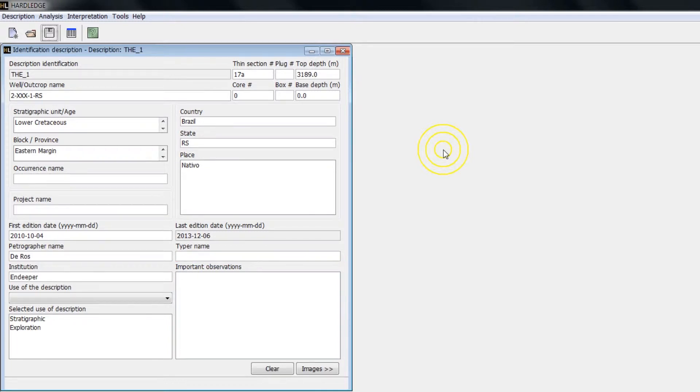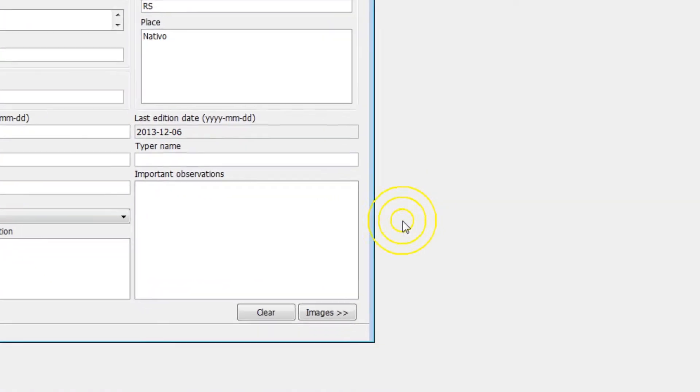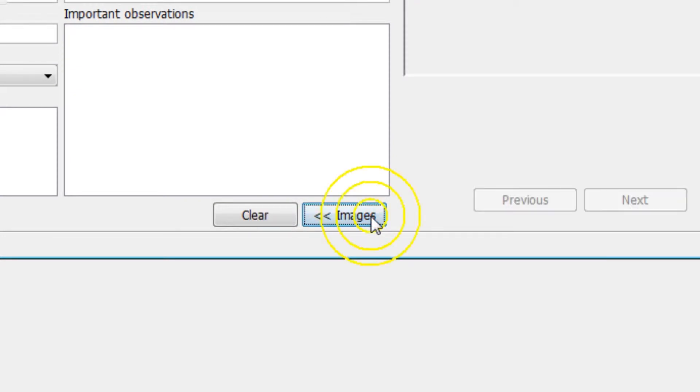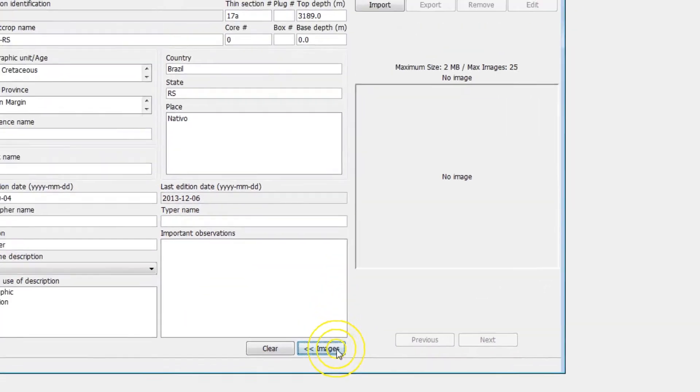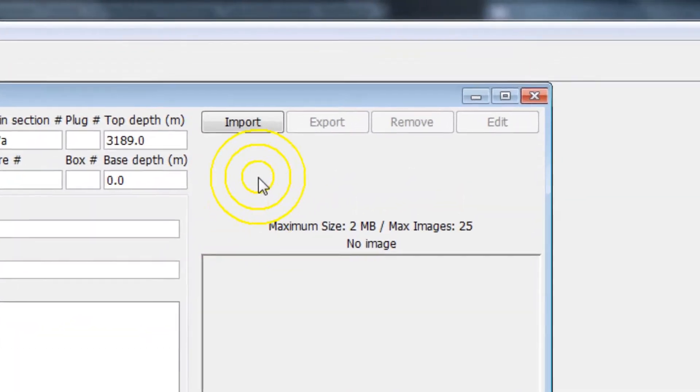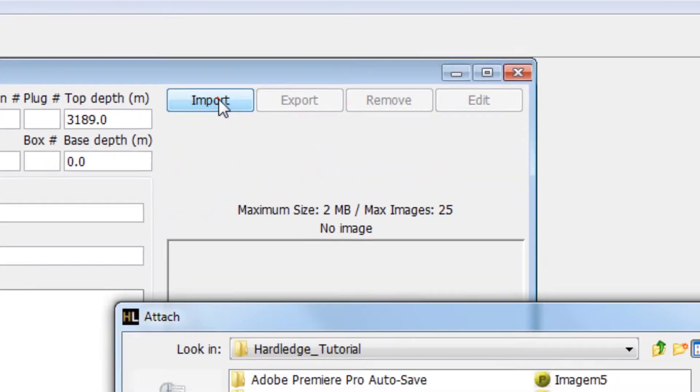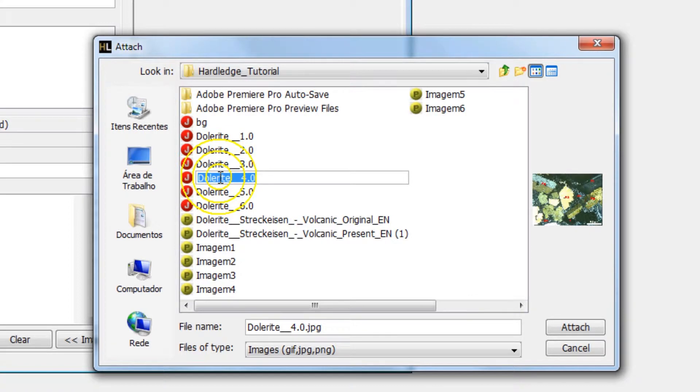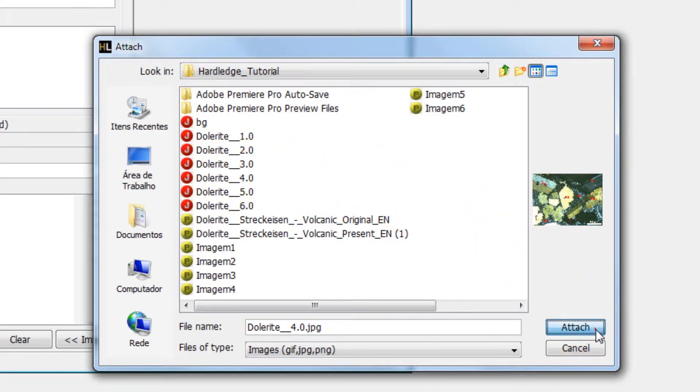To include photos in the new description, click on Images button in the right corner of the screen identification. Click the Import button and locate the image file on your computer. Select the desired image and click Attach.